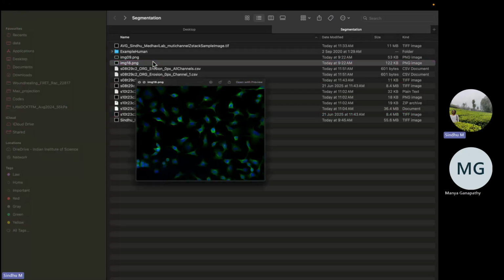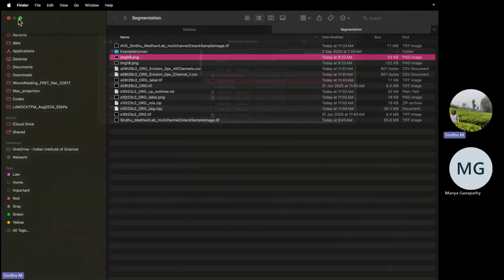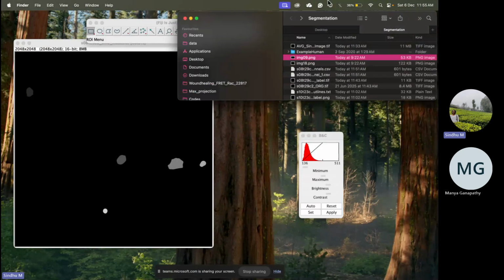And if you want, we can also run Cellpose for these two, and then run Labels to ROIs for 4 images in one go.